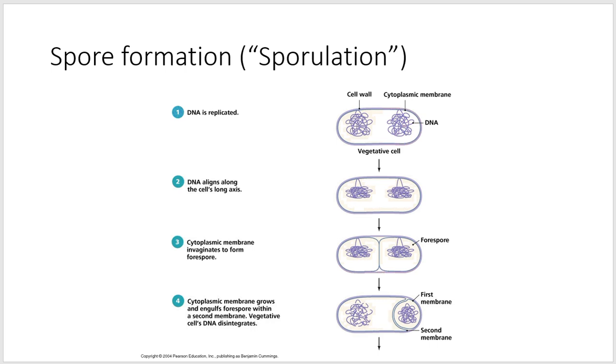And I want you to remember these endospores are very different than the spores in fungus. So spores in fungus are there for reproductive purposes. These endospores are not reproductive. They are specifically for self-preservation. So we see here, as soon as this cell is insulted by some environmental stress, it copies its DNA, which looks very much like it's trying to reproduce, but remember, it's not.